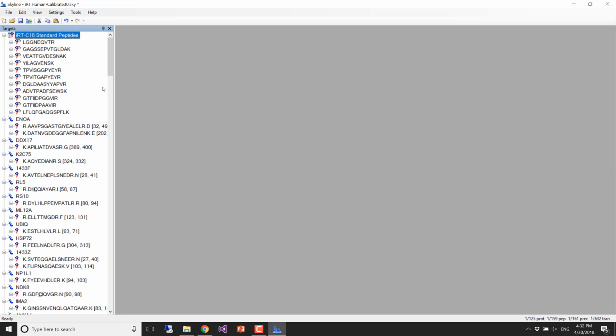All right, so now what did that do? How many transitions did we have before? Anybody know? Yeah. I don't remember the number, so I can click undo, and then 1,231, and then I redo, and now I've got 632. So I'm obviously going to have a better time measuring 632.